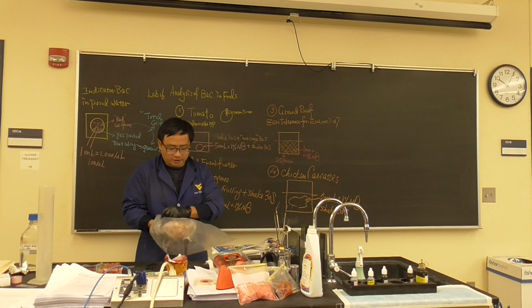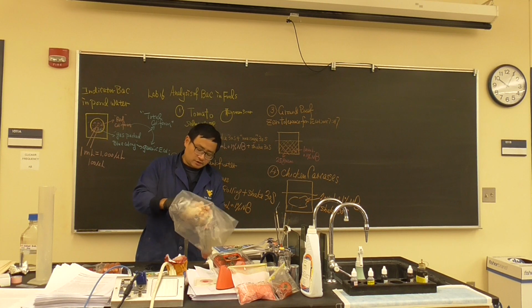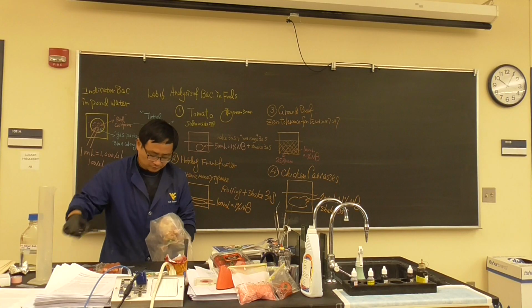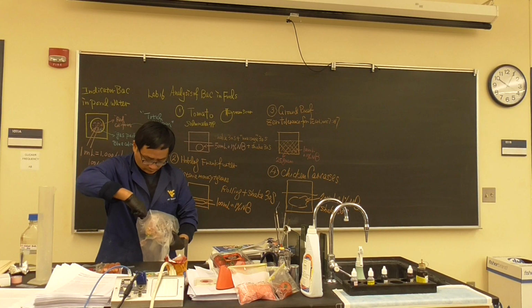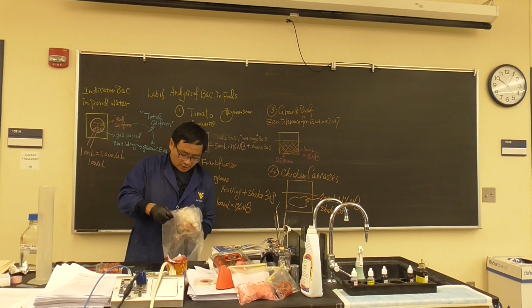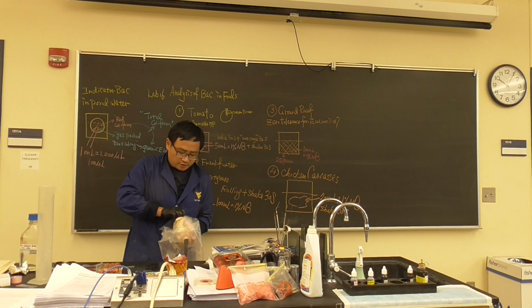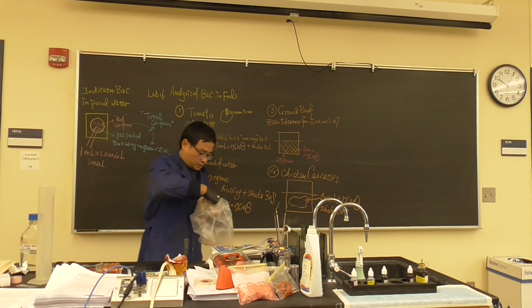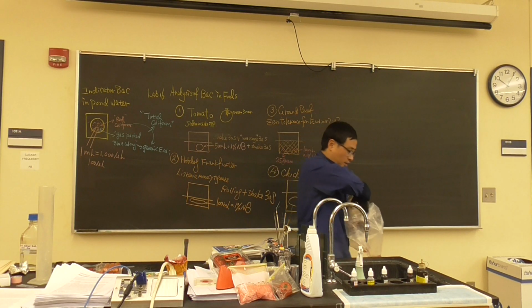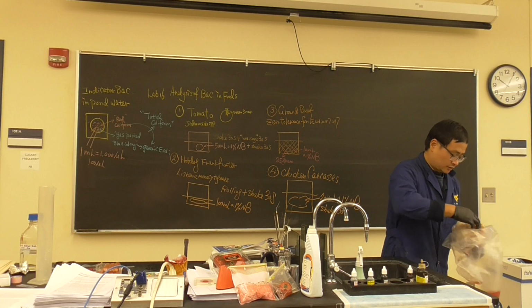We have a birds project about Campylobacter and Salmonella. You can see the bird sometimes has intestinal stuff there, so we have to take it out. Oh, this is the neck there. We don't like it, we took it out.